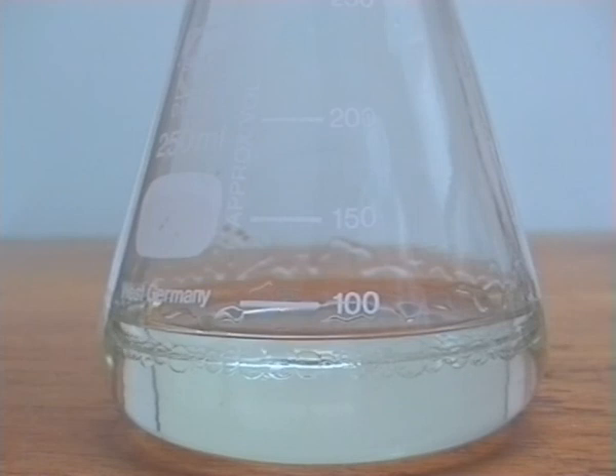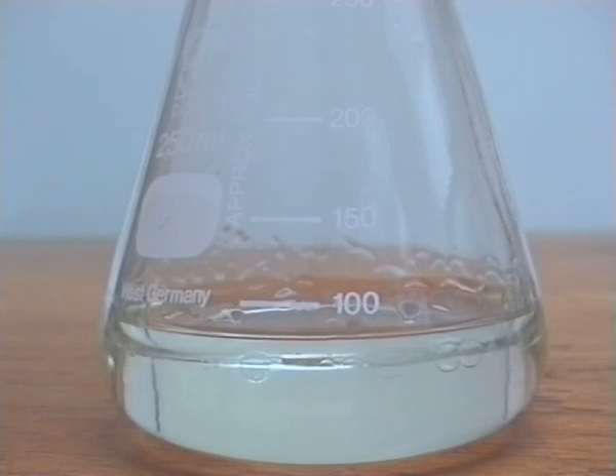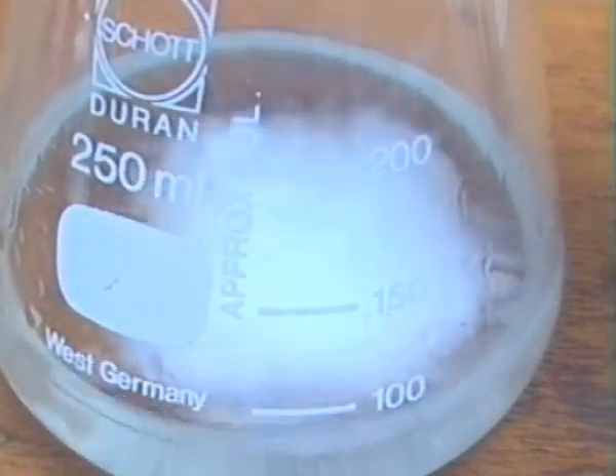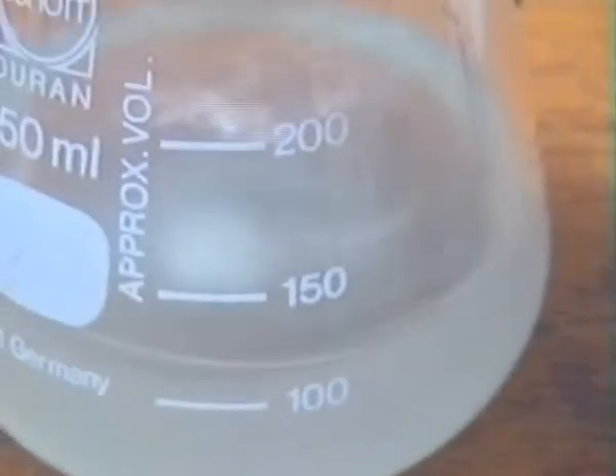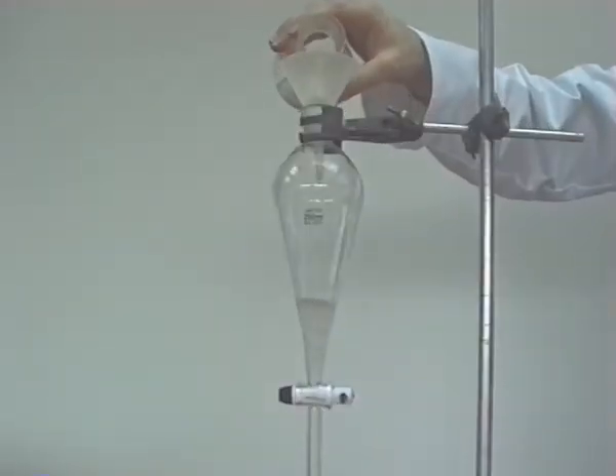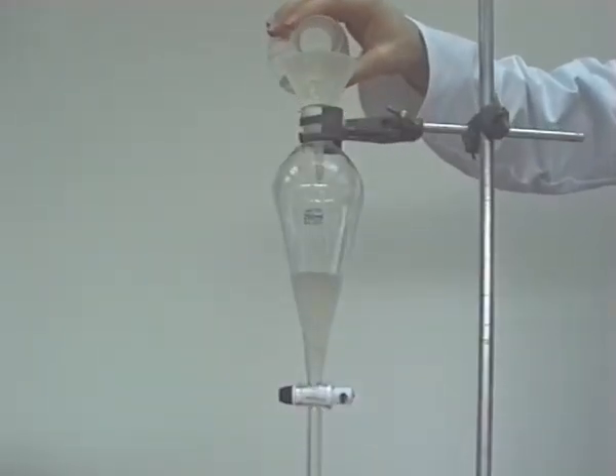The product was seen floating on top of the aqueous layer. Powdered calcium chloride was added to improve the separation. With the tap closed, the mixture was added to a separating funnel.